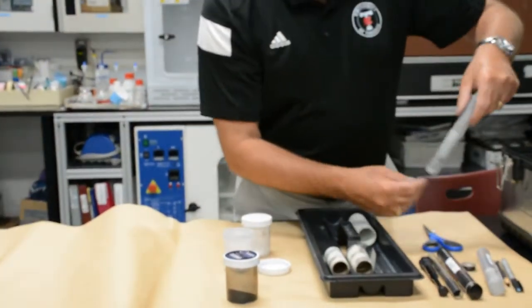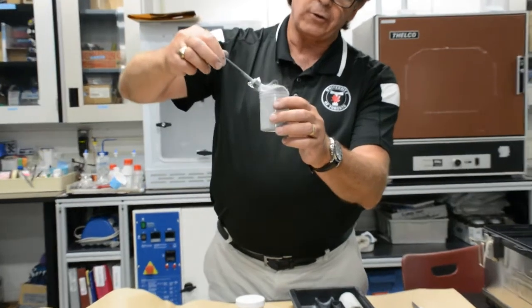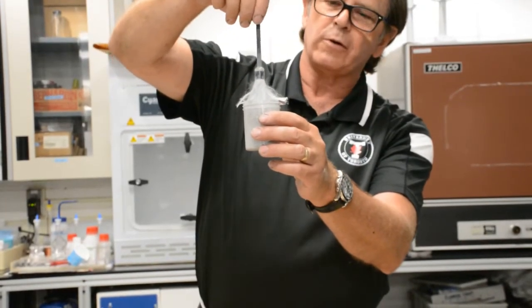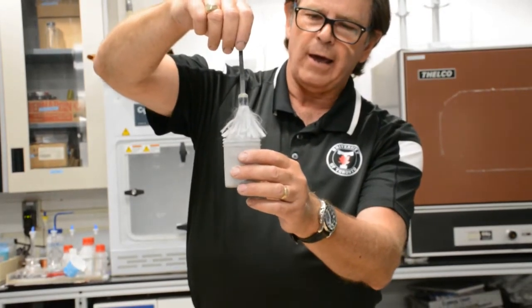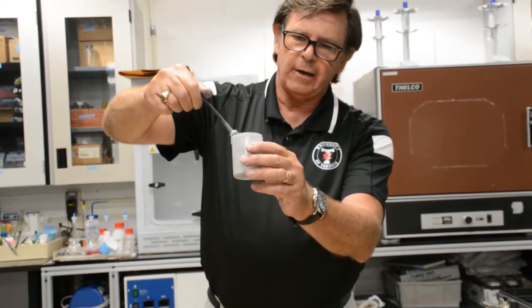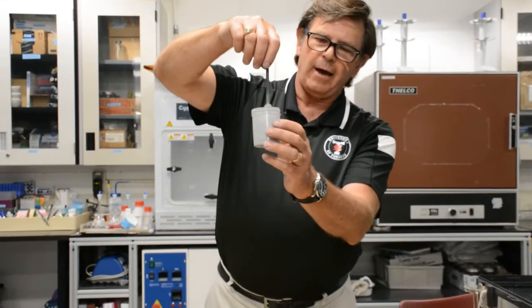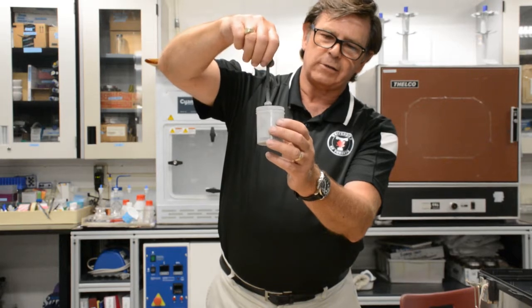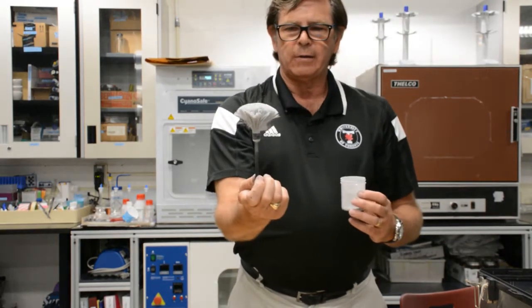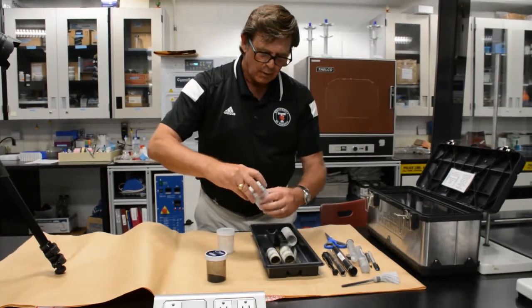So I have the analytical gray or the silver powder here now, so I'll use that brush for demonstrative purposes. By inserting the brush into this and doing it on an angle and slightly turning it, what it prevents is this type of action, which is going to potentially break the filaments down and cause a mess around the area that you're examining. So if you hold it on an angle and slightly turn it, it eases the filaments into the powder jar without damaging the bristles. Now the idea is to simply twirl it slightly as it's in contact with the surface powder, holding it slightly above and spinning off the excess powder, and then now it's fully charged and ready to go. So we'll set this aside for a moment and we'll continue on with our demonstration.